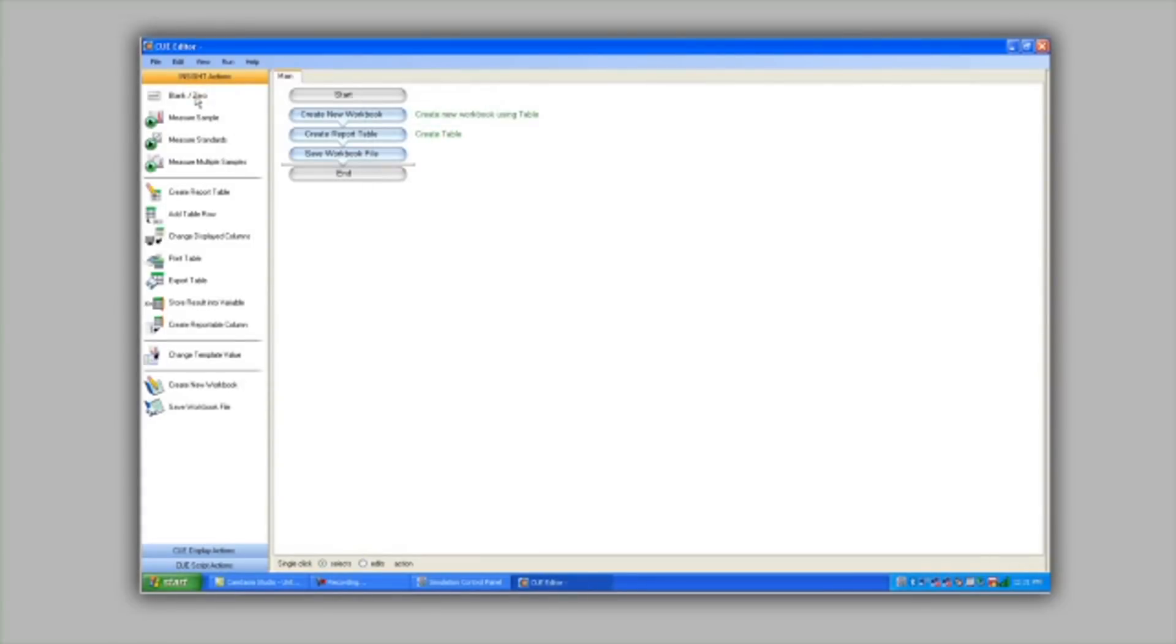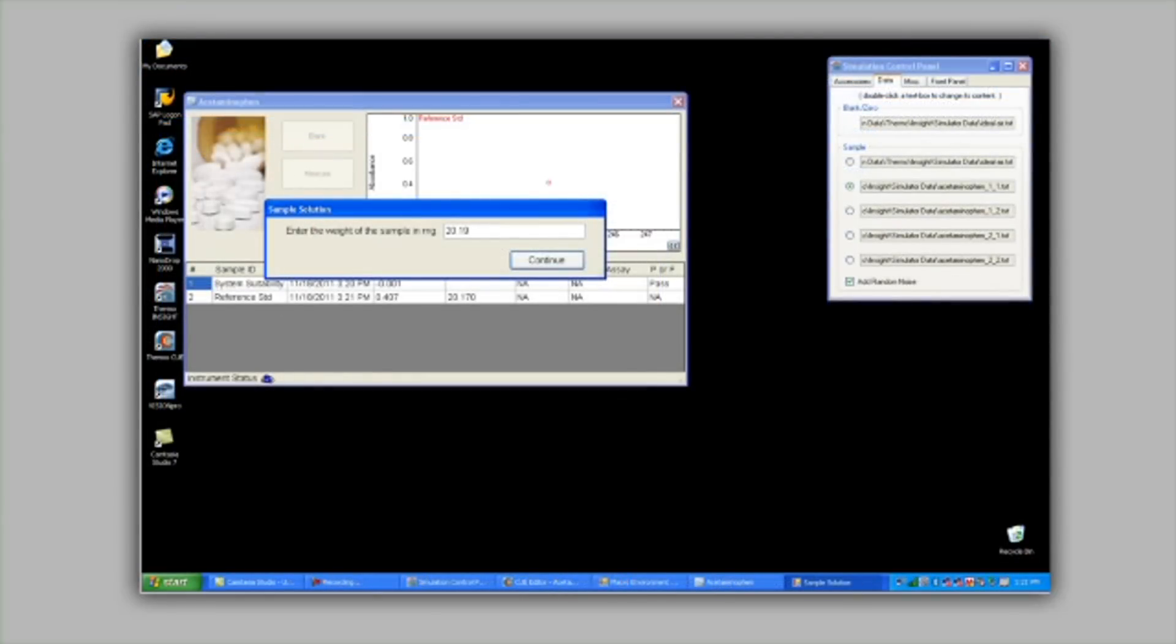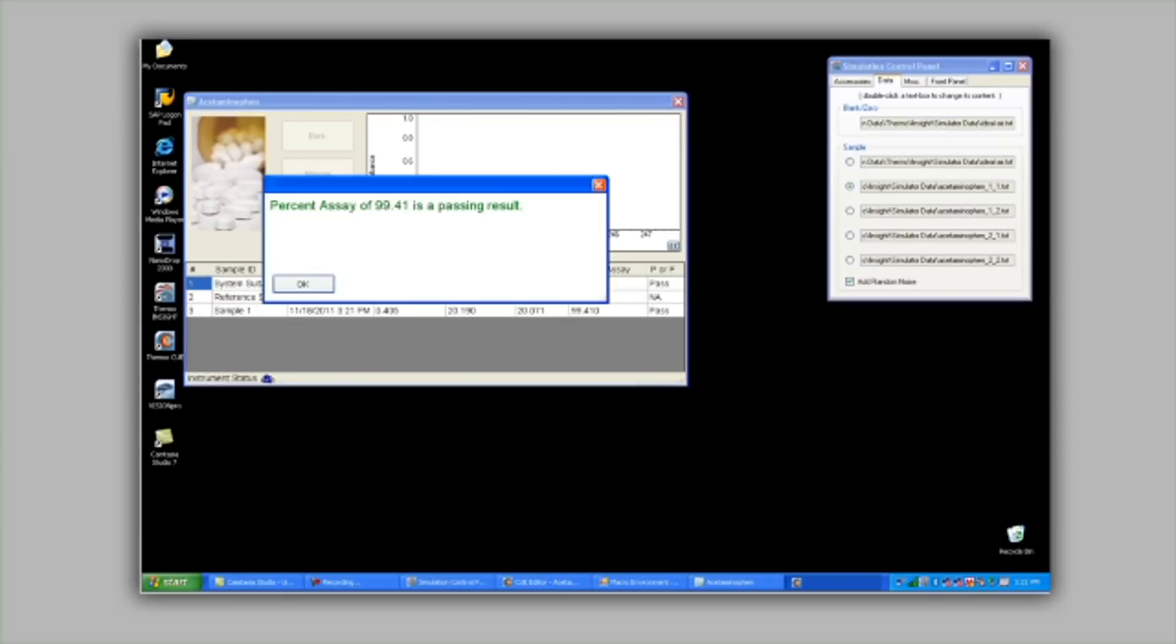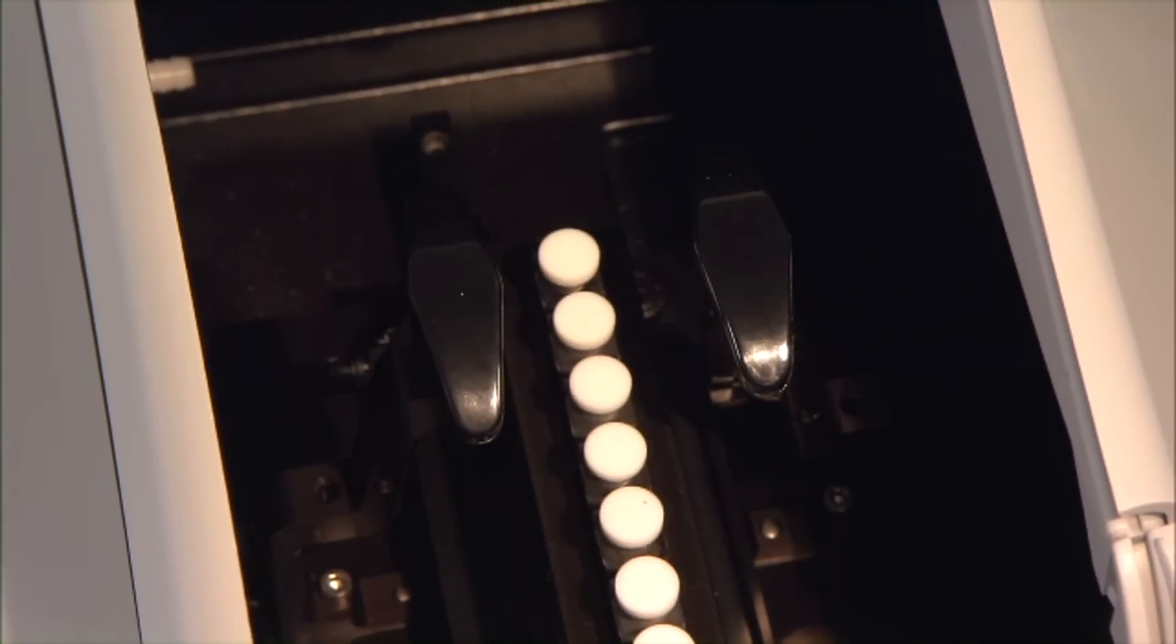For example, a QA QC lab can customize the Evolution 200 to enforce adherence to defined protocols, perform complex data calculations and analyses, determine pass-fail results based on previously defined criteria, and utilize compatible accessories.